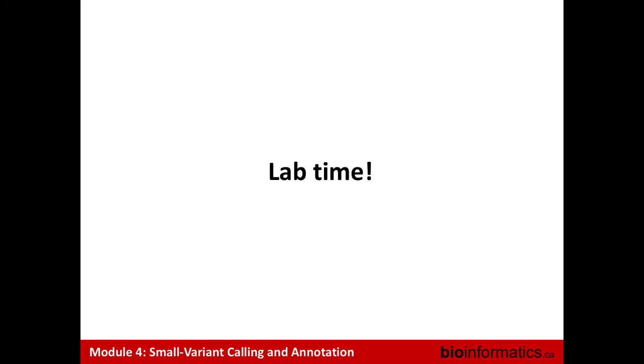So first, it's more difficult because we work with a paired approach, where we usually have a blood sample with a tumor sample. What we want to do is find what in the tumor sample is different from the blood sample. That's the classical case, because if you work with, for example, leukemia, which is a blood cancer, you don't use blood, so there's more complication again. So we have this paired approach that makes us use different tools and different methodology to do variant calling.